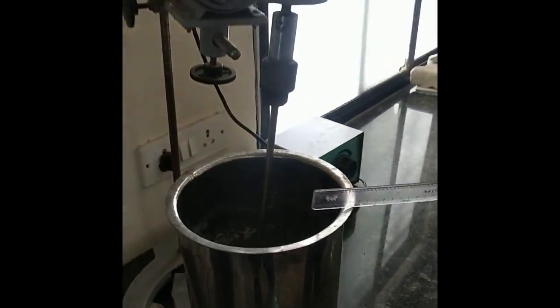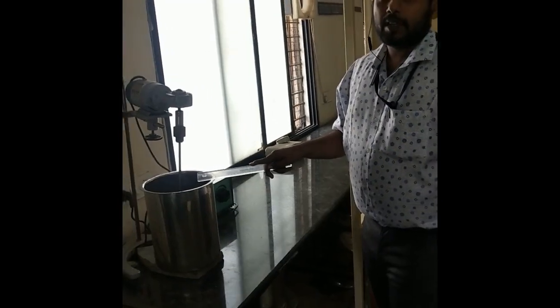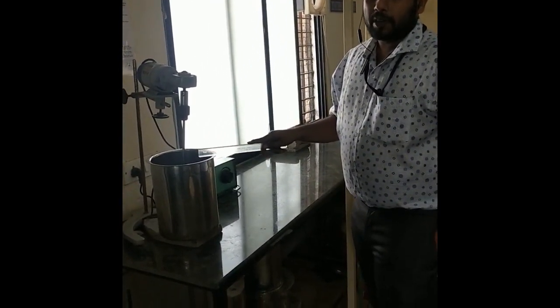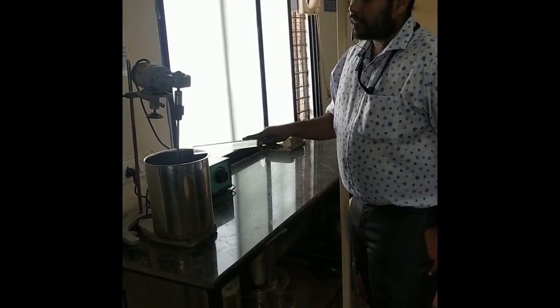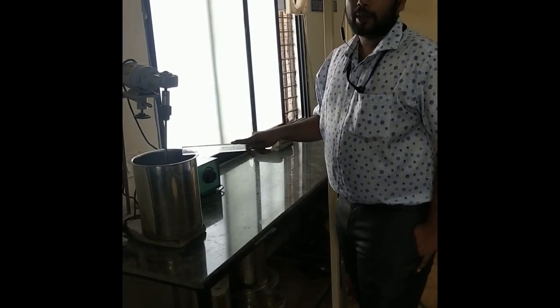First one is sodium hydroxide, 0.1 normality, ethyl acetate, 0.1 normal, oxalic acid, 0.1 normal, and HCl solution, 0.1 normal. So firstly in the procedure, we need to transfer exactly 1000 ml of ethyl acetate to the cylindrical vessel. And then you need to transfer 900 ml of sodium hydroxide.